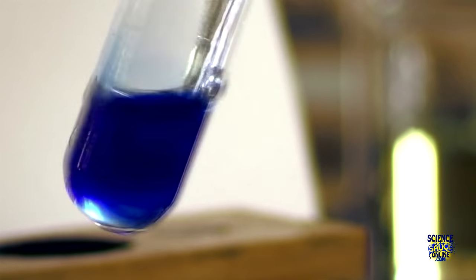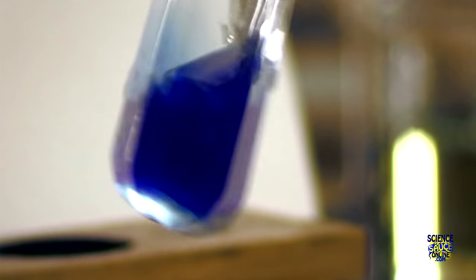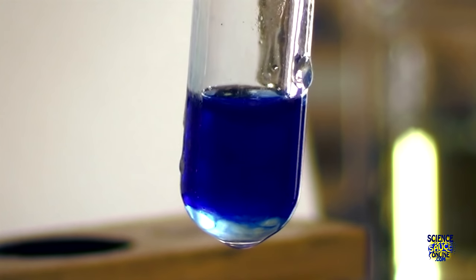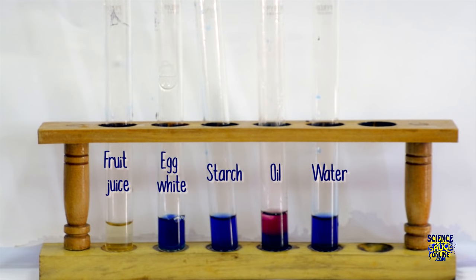Repeat this process for each of your samples. When we make a final comparison we can see that the fruit juice is the only one that has turned the DC-PIP colorless.